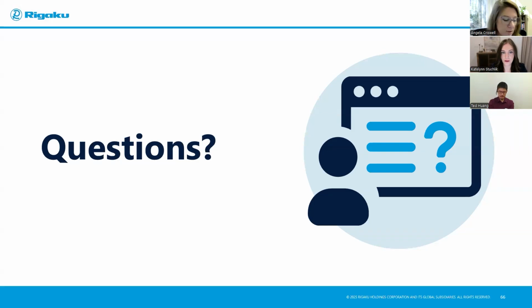So then what you can do, let's see, I'm just going to use this small thing. I can take my small thin sample, move it as close as possible to the source, and I'm only rotating like this, a half scan. And sometimes you can get a better resolution on the edge of your sample that may get you in the range of what you need to perform your analysis. So that's something you can try.